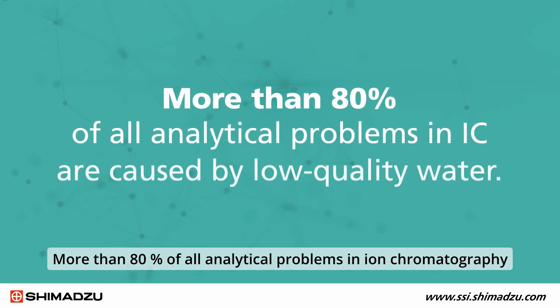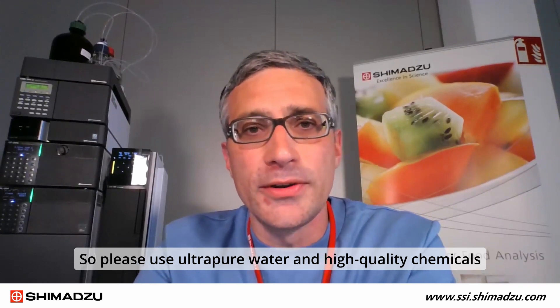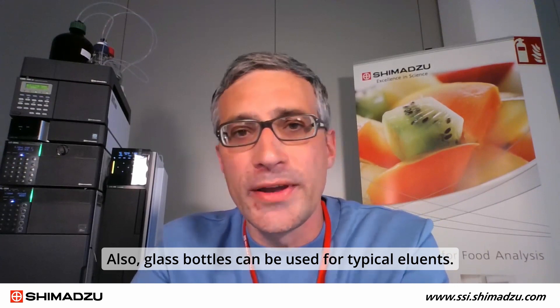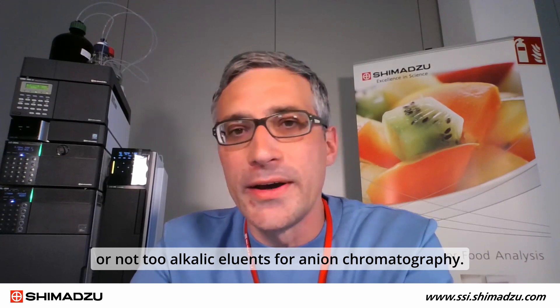More than 80% of all analytical problems in ion chromatography are caused by low-quality water. Use ultra-pure water and high-quality chemicals to prepare eluents, standard solutions, samples, and reagents. Glass bottles can be used for typical eluents, for example those used in cation chromatography, or non-carbonate eluents for anion chromatography.